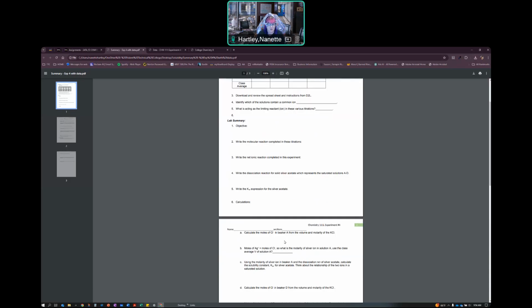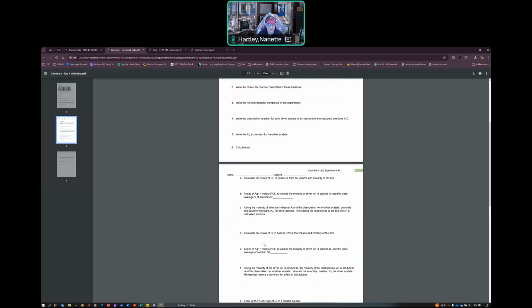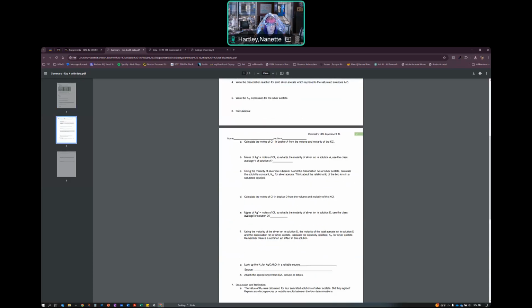Show me an example of all your calculations, and show me how you do this calculation. If your moles of Ag+ equals your moles of Cl-, what's the molarity of the silver ion in solution D? Walk me through all of your calculations.